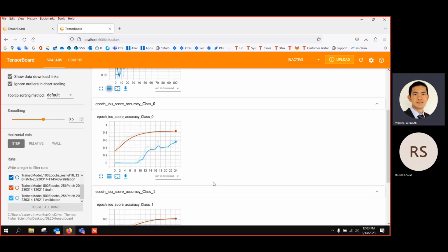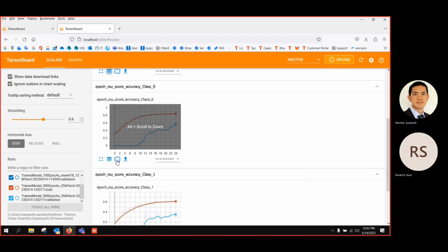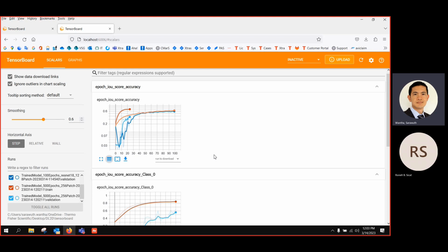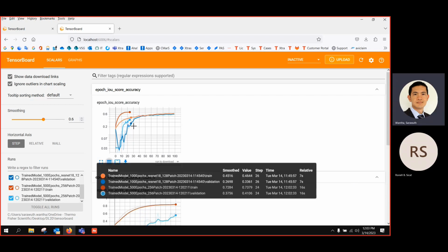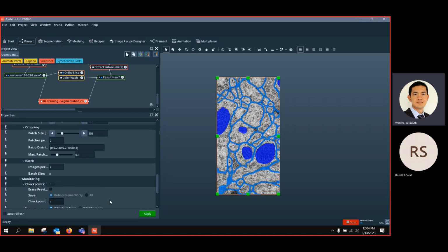Yeah, I think I did something wrong with the parameter, because they stopped at only 20. It seems also that they have big level. Yeah, that's 0, that's 1. Oh yes, but if I look at the summary, they should have everything, but they stop at 20 epochs. I wonder why. Or maybe I didn't put the right parameters.